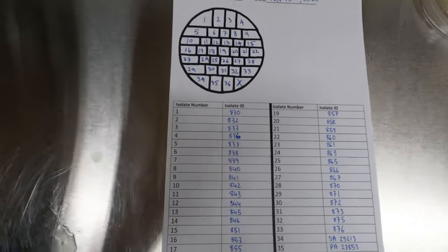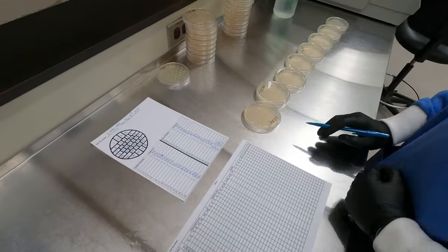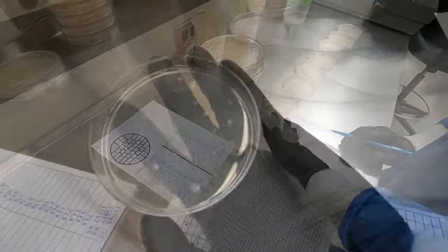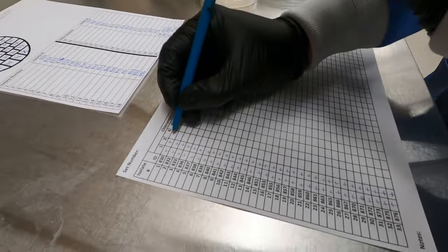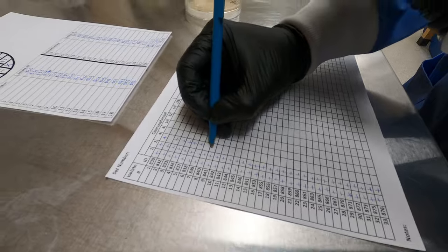Here you can see a plate map where each spot is numbered, and below that a key where we've described which of our isolates is found in each spot. We then inspect the plates and record presence or absence of growth at each drug concentration.